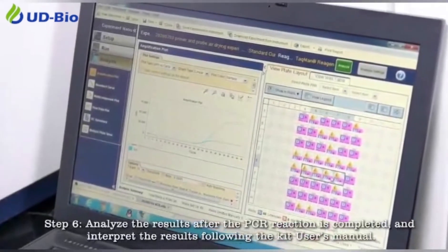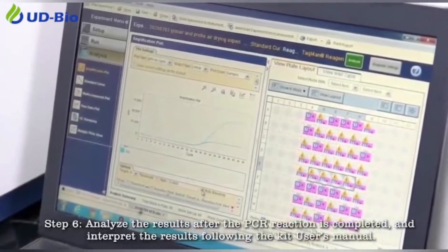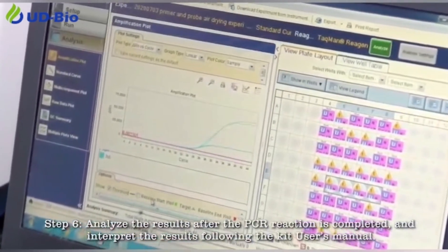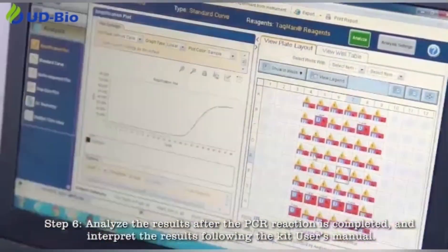Step 6: Analyze the results after the PCR reaction is completed, and interpret the results following the kit user's manual.